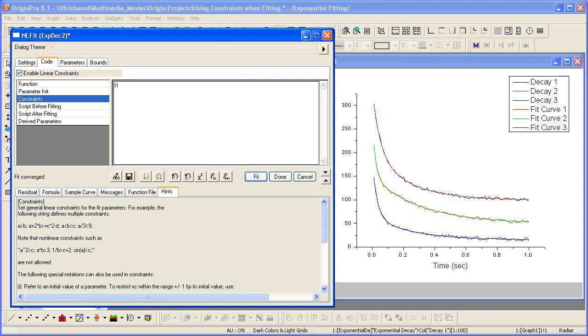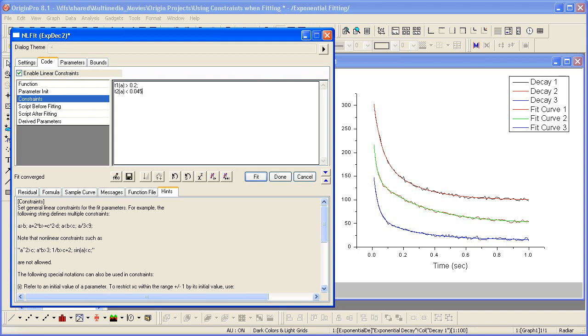Now let's constrain T2, all the T2 parameters, to be less than 0.045. So from the hints, we see that each constraint should be entered and followed by a semicolon. We can also go down to the new line and type T2 A for all less than 0.045.